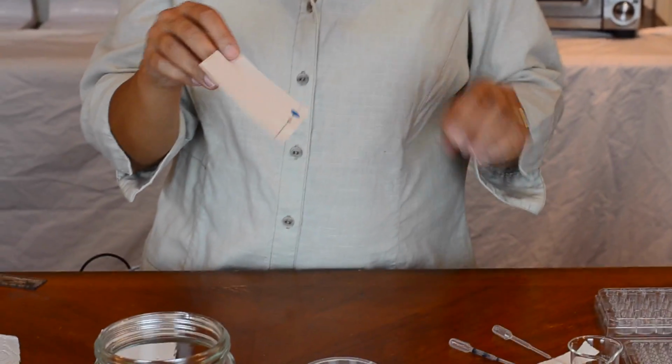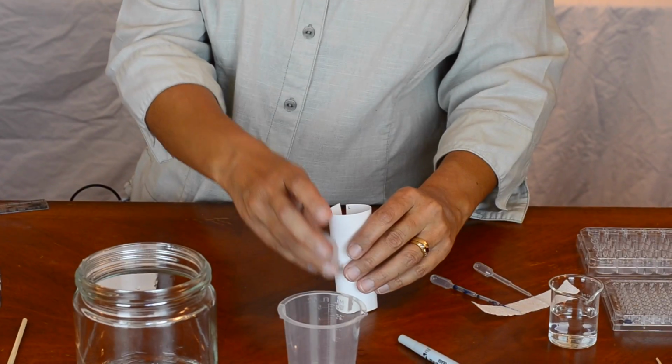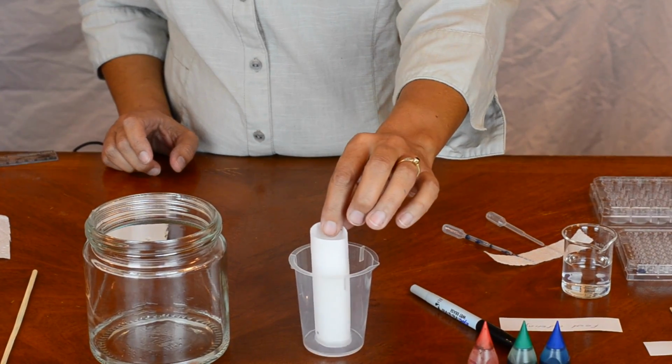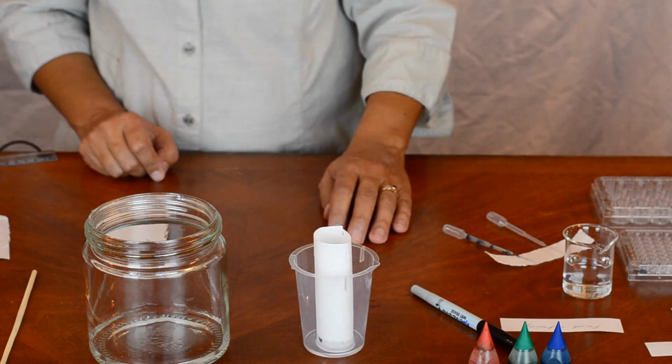So now that everything's been applied, I'm going to go ahead and curl it up so that it will fit into my beaker. I'm going to use tape because I can't get my stapler inside. I do need it to be as flat as possible for the bottom edge, so you want to try to hold your cylinder nice and flat at the bottom so that it sits level in your distilled water. And then I just drop it right into the beaker, and you can see the water start to diffuse up the paper.